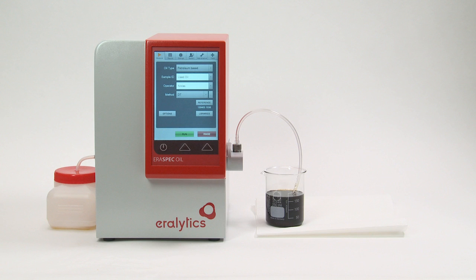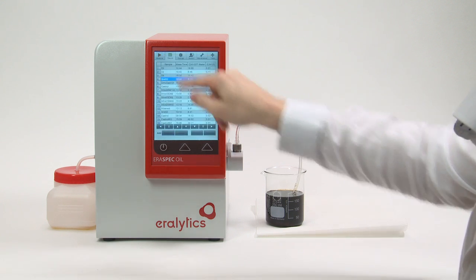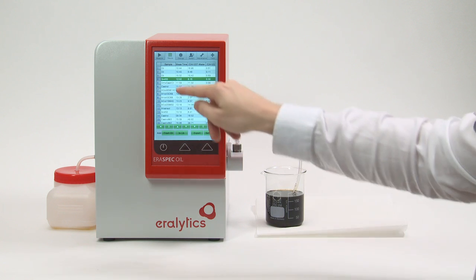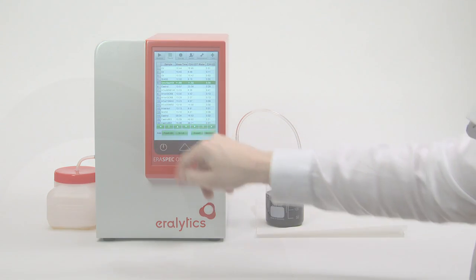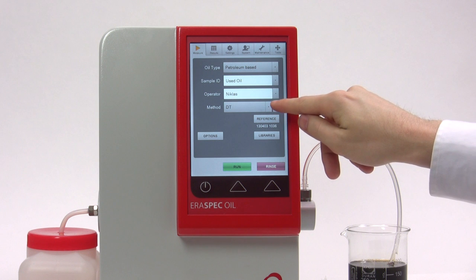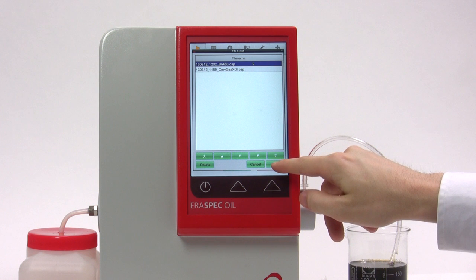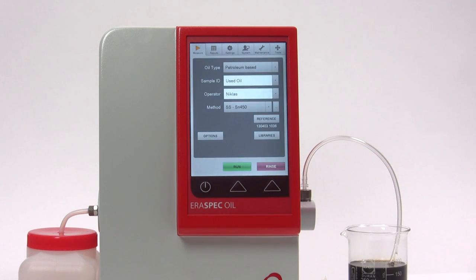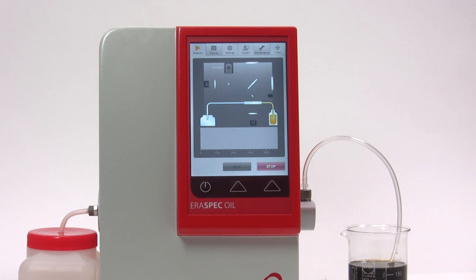To make a stored result available as a fresh oil spectrum, click the Results tab, mark the line of the sample that shall be added as fresh oil, and click the Add Fresh Oil button. The fresh oil spectrum can now be selected by clicking the button next to the method in the Measure menu. The method field will now show 'SS' for spectral subtraction and the name of the fresh oil spectrum. Press Run to start the measurement.